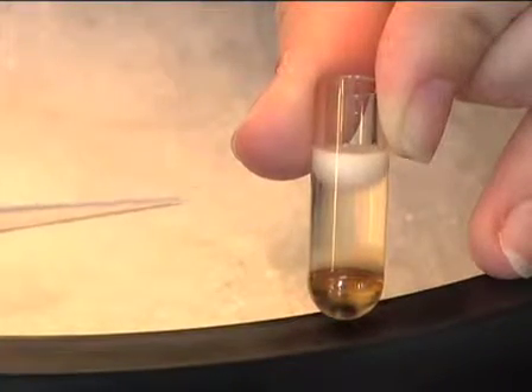My name is Marie Cross and I'm a graduate student in Dr. Maureen Powers' lab in the Department of Cell Biology at Emory University in Atlanta, Georgia. Today we will show you how to fractionate egg extract into soluble cytoplasmic and light membrane fractions.